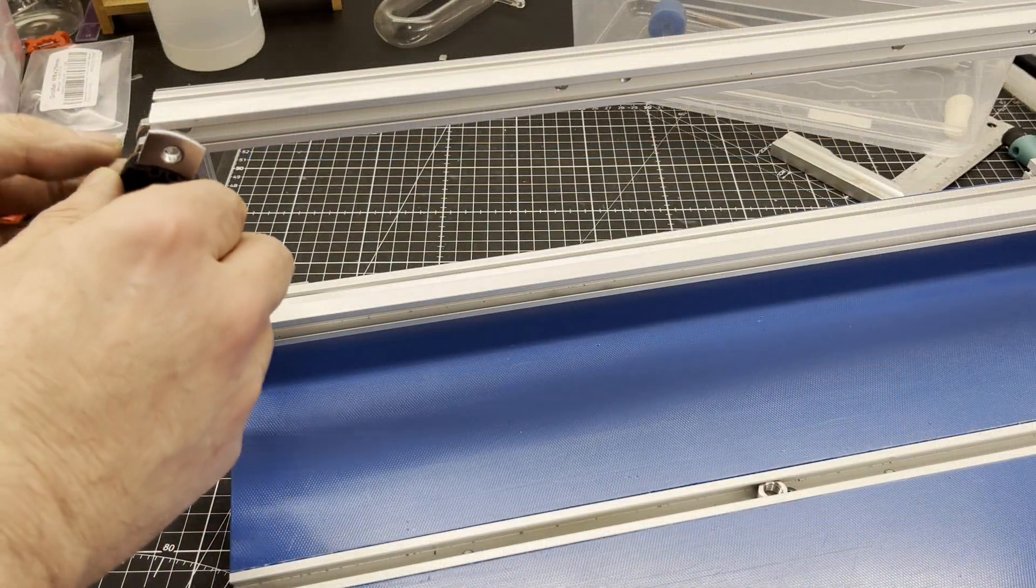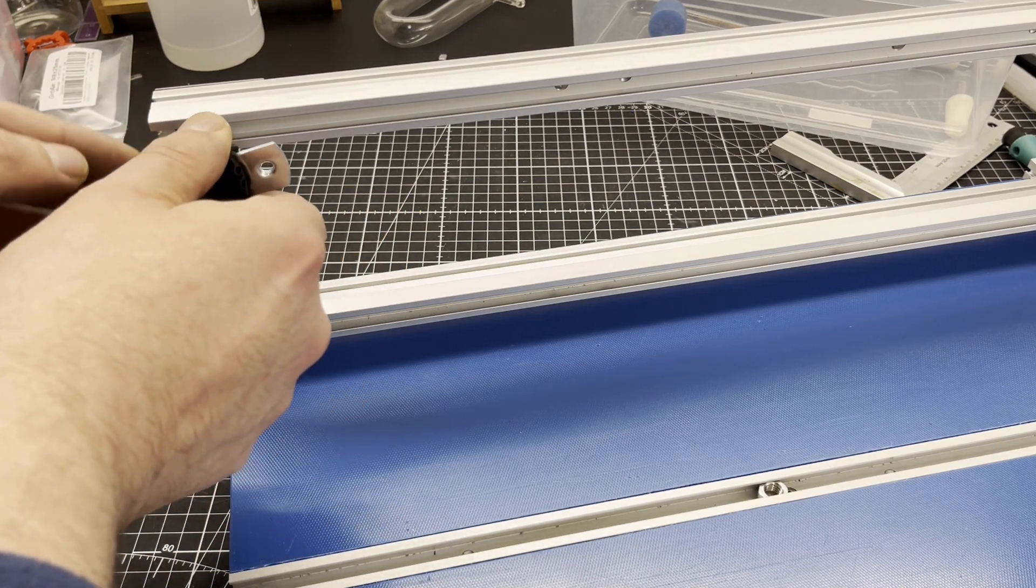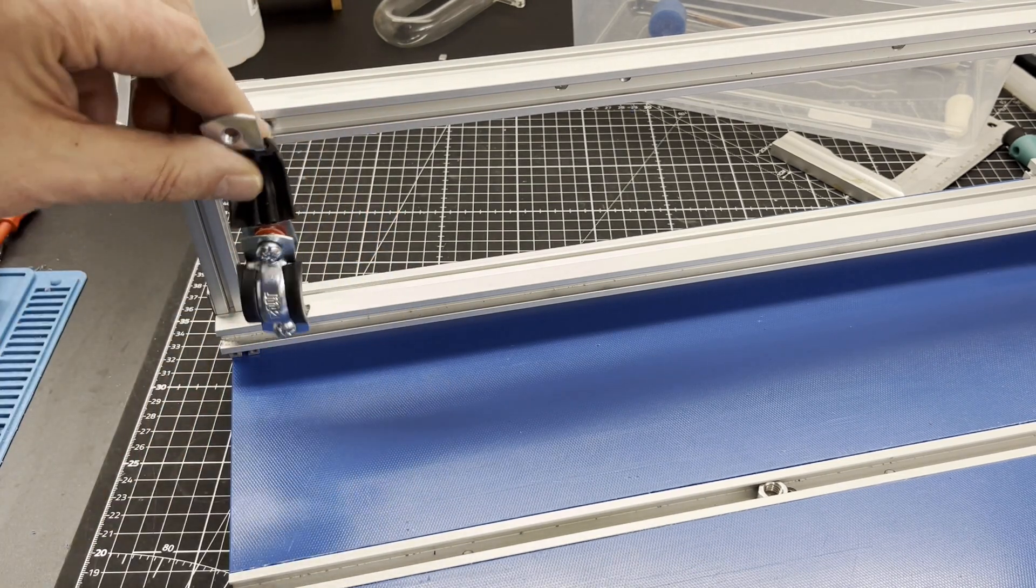Pipe clamps from the DIY store were used to attach all the glassware. They are much cheaper than lab clamps and are available for every pipe diameter.